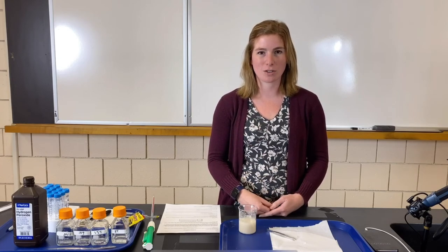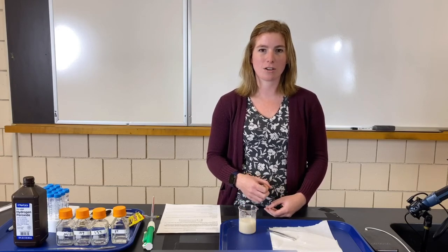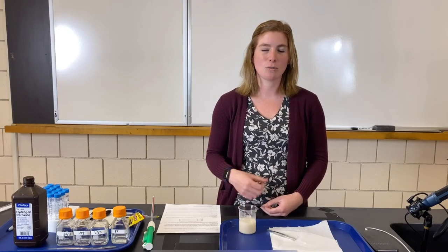Some background information: in yeast there is an enzyme called catalase, and it works on the substrate hydrogen peroxide. When the enzyme acts on hydrogen peroxide, it breaks it up into water and oxygen. Oxygen is a gas, so when it gets produced inside a liquid it creates bubbles, which should cause the filter paper soaked in yeast to rise to the top of the liquid. We'll test that the enzyme is working by seeing how quickly the filter paper rises.